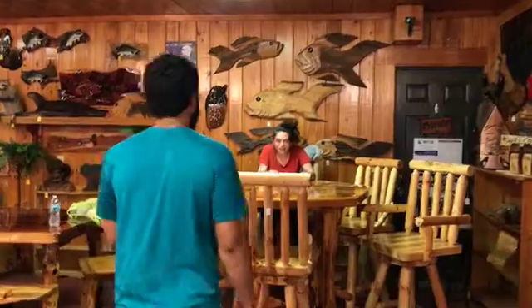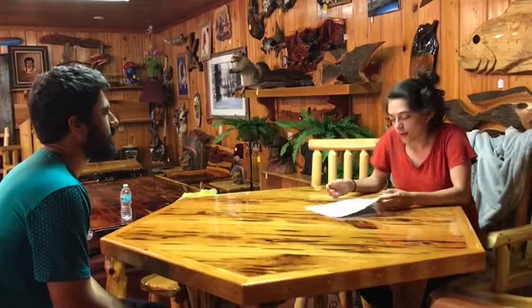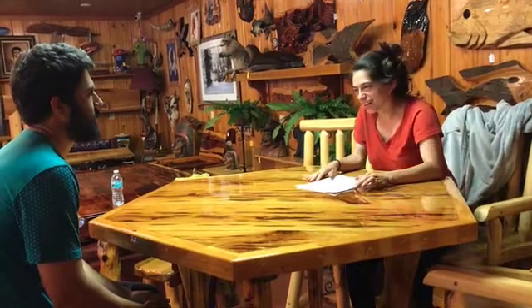Hello, Hunter. How can I help you today? I'm a little confused on the Brad essay. Do you think you could help me? First of all, it's the Bradford Assay, and... Yeah, that's it! Right. As I was saying, yes, I can help you.